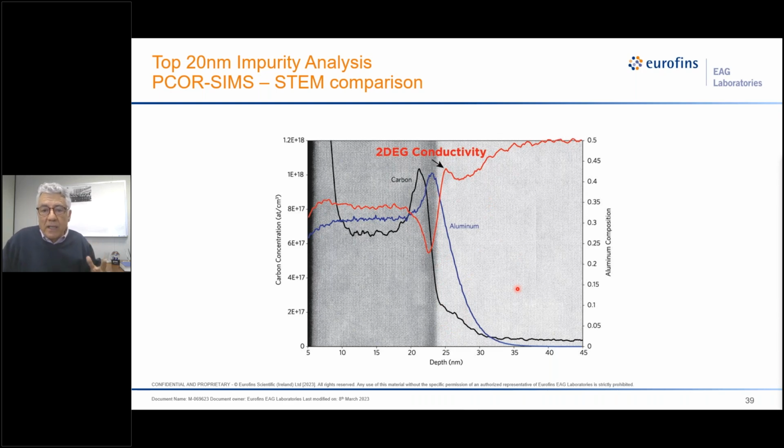So it's always good to have a secondary method to check on the SIMS, or vice versa. If you're just doing microscopy, then you may not be able to get the carbon and the location of the carbon with these stoichiometries. So it's always best to do both of them. But once you arm yourself with this calibration, with this new protocol, you can actually do quite good studies.